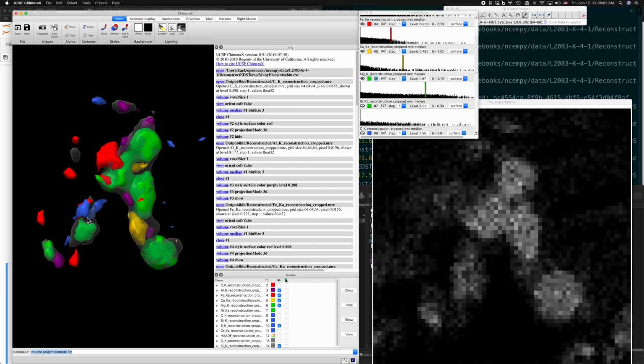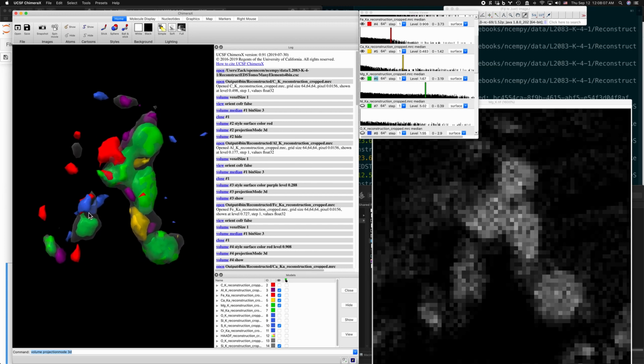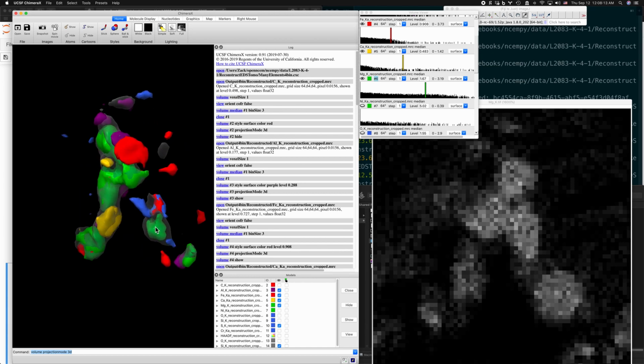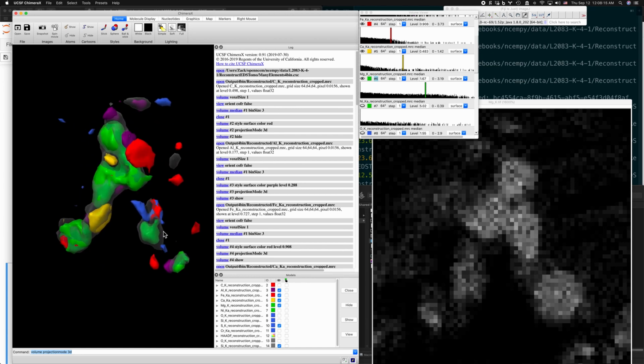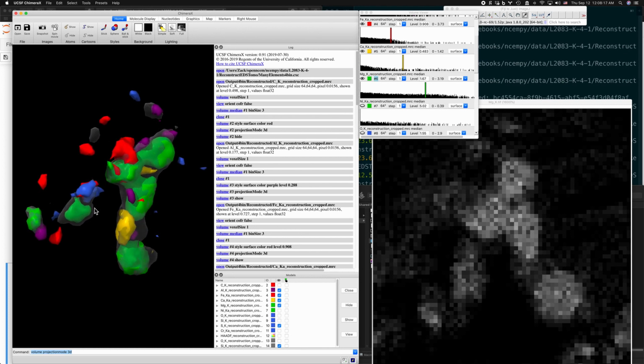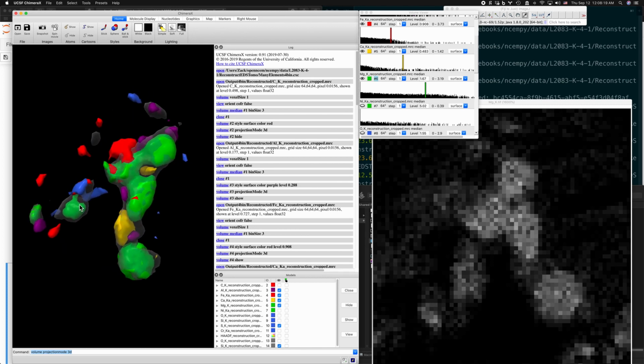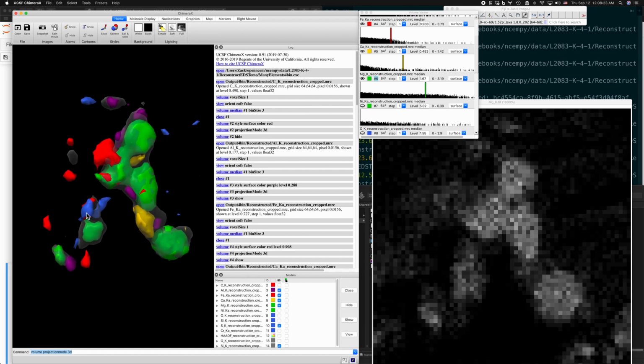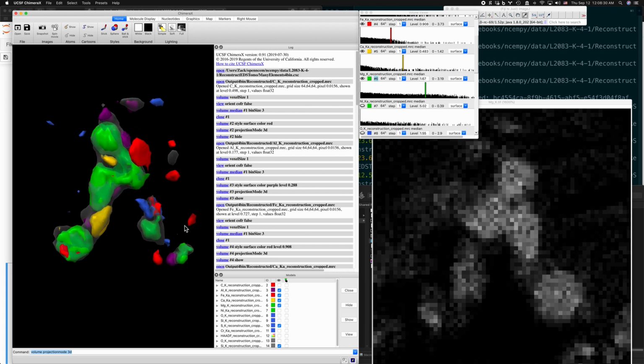And I'm also interested in if anyone has ideas about how to set more automatic thresholds that don't have a human bias introduced. So I believe this is an area where we will develop in the future and where something needs to be improved. But for the here and now, this actually works very well and gives quite a nice, meaningful result.